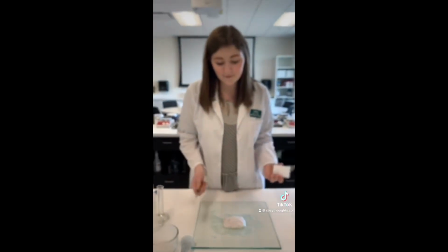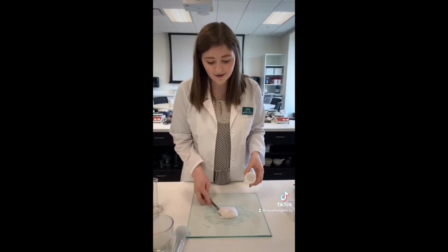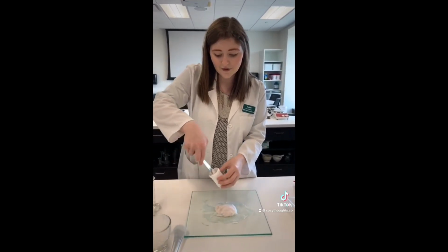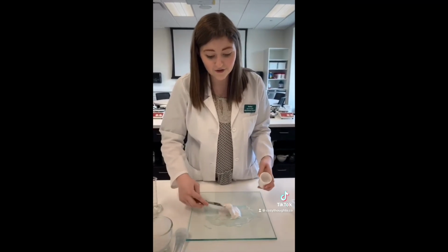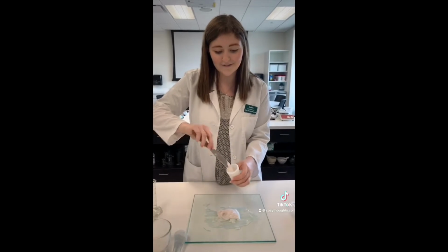The last step when you finish your preparation is called packing the jar. So you just take an ointment jar, take a little bit, and try not to get it on the sides. And you just continue that until the entirety of the formulation is in the jar.